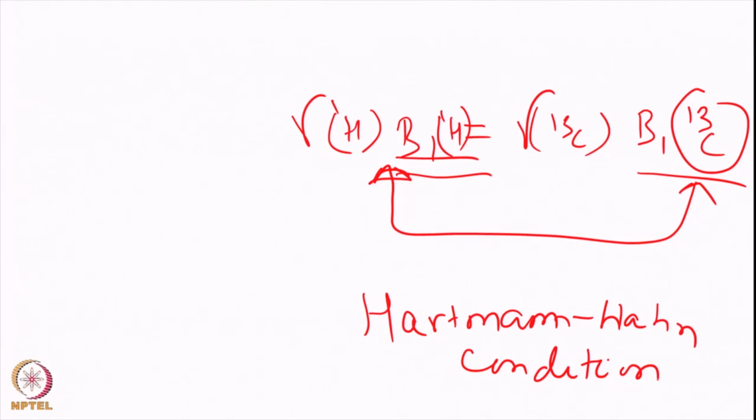This condition is at the heart of many experiments like the ROESY or TOCSY experiment, where we bring the magnetization into the xy plane and lock it for some time by applying an RF pulse on H spin and X spin. It is also at the heart of all the dipolar-based polarization transfer that happens in solid state, where we enhance the signal of X spin by transferring polarization from H spin. In solids we generally detect on X spin, because the lines are sharp for X spin.